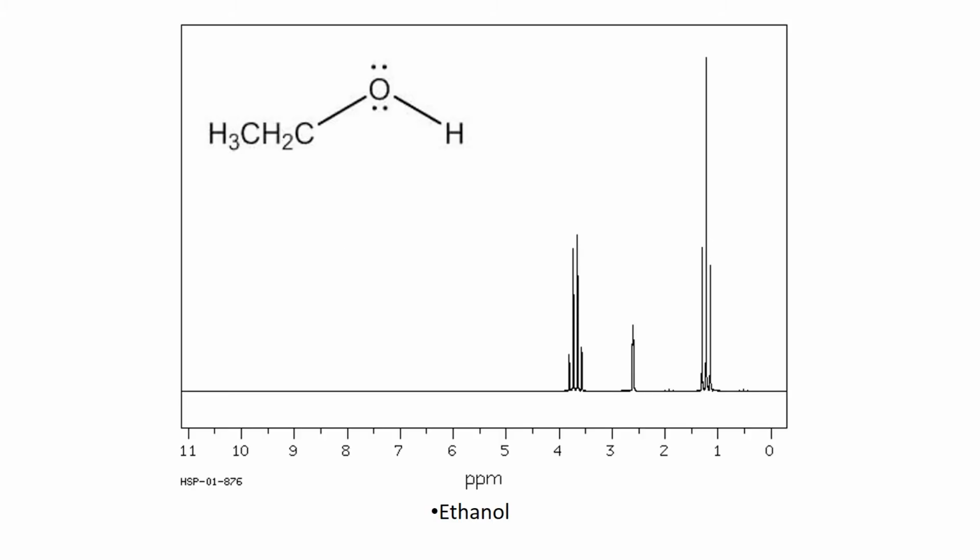I've put together several examples of different functional groups, different scenarios that can come up, and also some example problems that you could see on an exam-type question. I put this one in here because, one, it shows again that ethyl splitting pattern, the quartet triplet, but also because it shows an OH group.